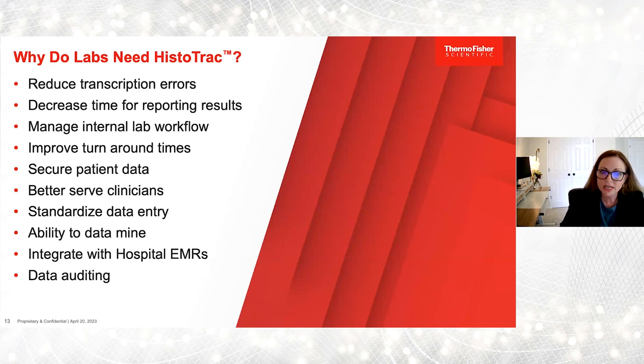We can secure the patient data. We can standardize your data entry, so a lot of the menus will be drop down, which means you have to select the value. By standardizing that data, it helps us to data mine it easier. We can integrate with your hospital EMRs, which your clinicians will love, and which will help you serve them better. And then we're able to audit the data. Any changes happening within the HistoTrac system, we can capture an audit history on and produce a report if you need to.